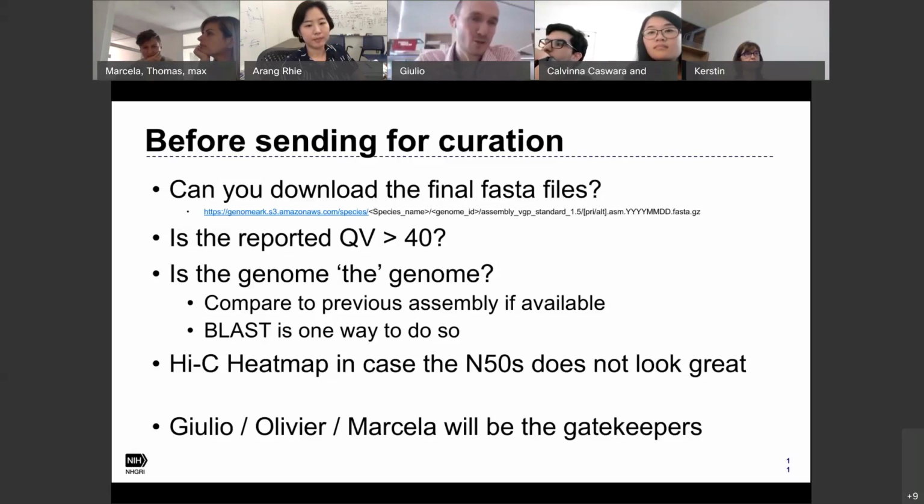If you're polishing something that has already been polished, then maybe it will not detect that. So Chai has added to the latest version of the workflow a QV calculator app also after the very first round of polishing, and I would encourage to look at that one too.